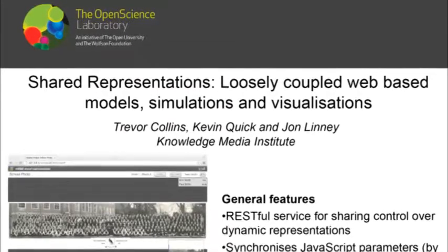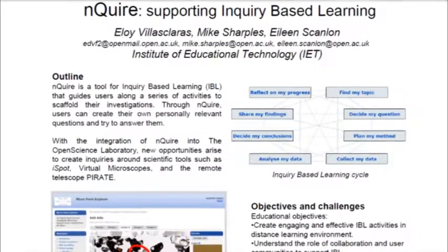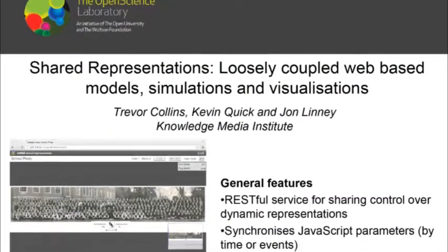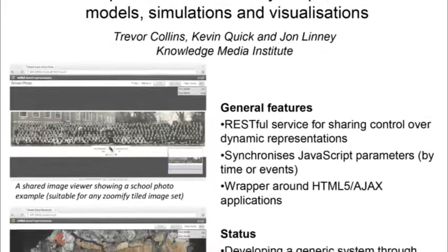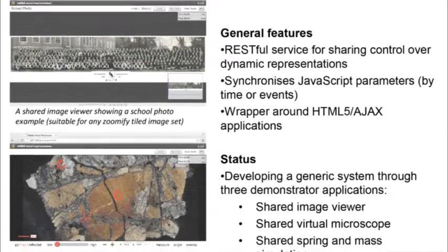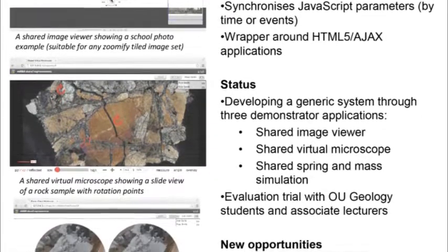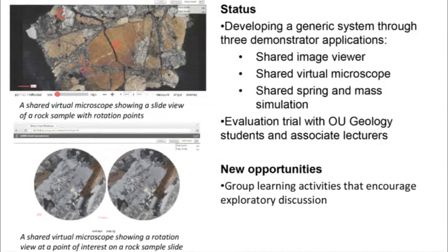Two specific projects in which we're involved are the Shared Representations and Enquire. Shared Representations is a new innovation in virtual microscopy. We're hoping to allow students to be able to share visions so that more than one student can look at a microscope at the same time. It's akin to standing around a microscope and discussing something that you can see.